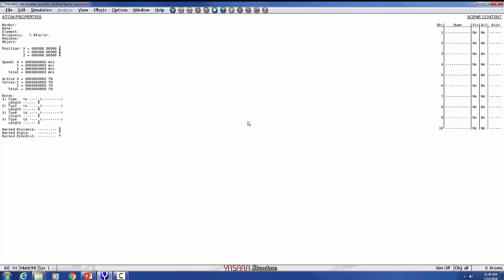The point being that if you produce a figure or an image that you want to use for a publication or a poster, you should start off with a white background so that there's no distortion, it's easy to see, and you don't have to go back and recreate the image so that it works in a PowerPoint or whatnot. All right, so you can start off with that.